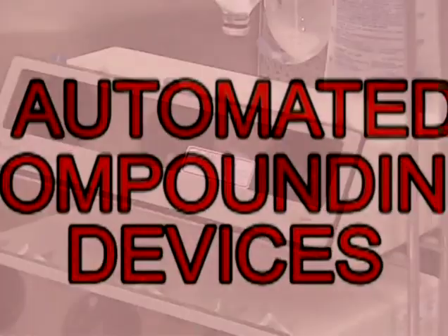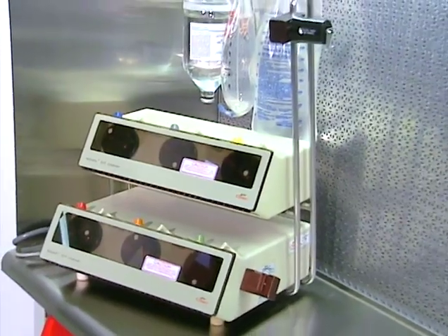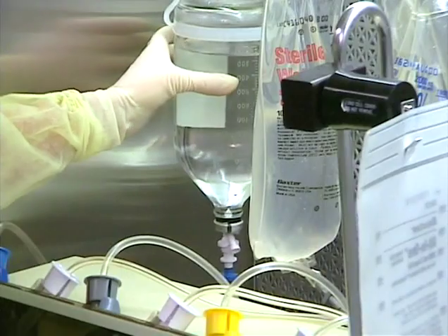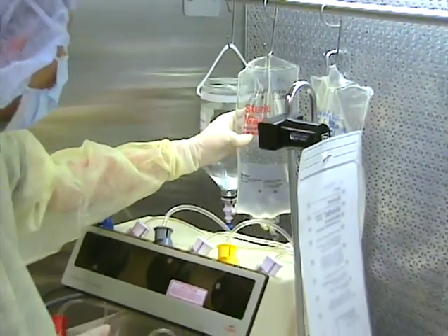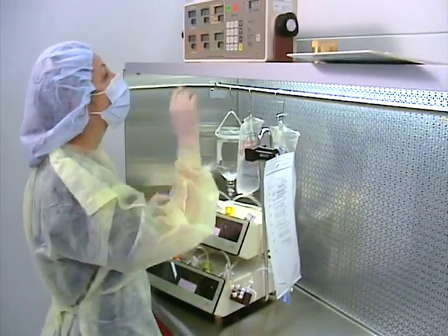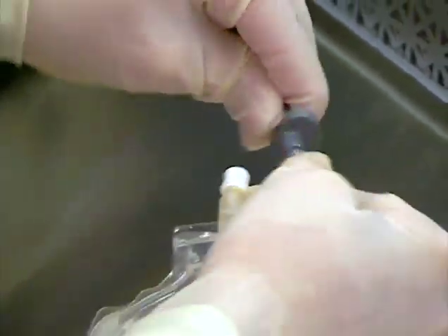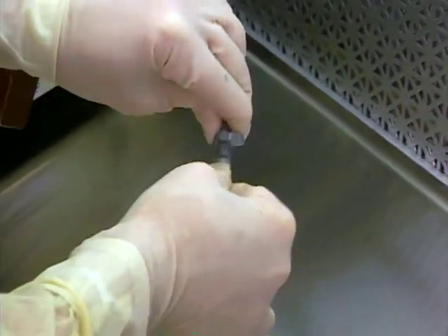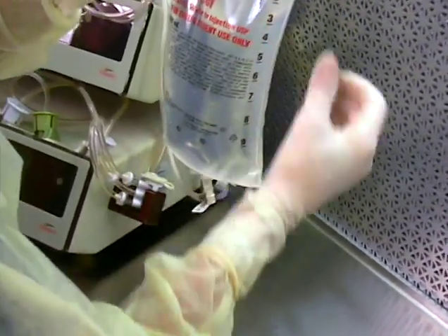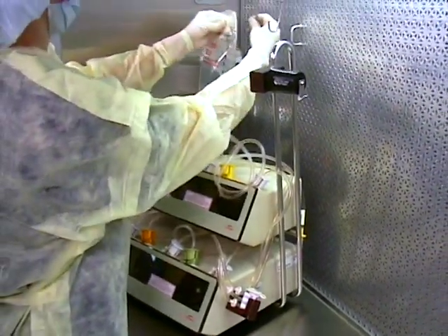Automated compounders can reduce the time required to transfer large volumes of solution for complex compounding tasks such as preparation of parenteral nutrition solutions. However, the use of automated compounders presents its own set of risks. Any contamination introduced or errors which affect accuracy may adversely affect multiple patients. Care must also be taken when changing source solutions to maintain first air flow. If data entry is incorrect or mispumping occurs, inaccurate volumes will be transferred. If the wrong source container is attached, the final solution will be incorrect.